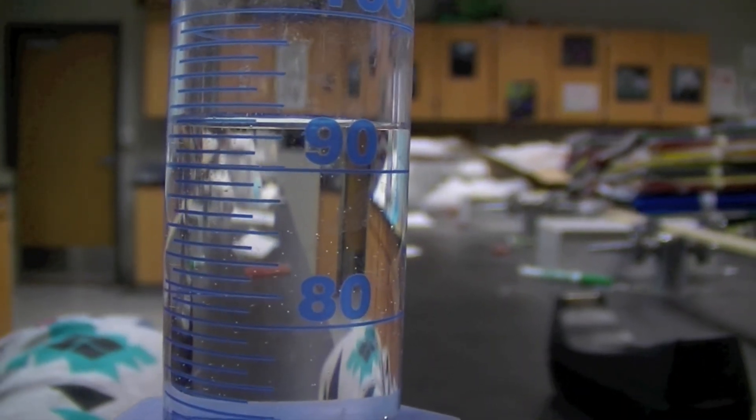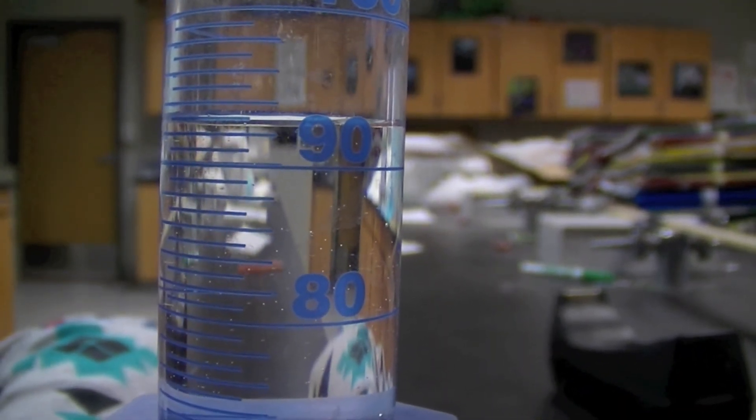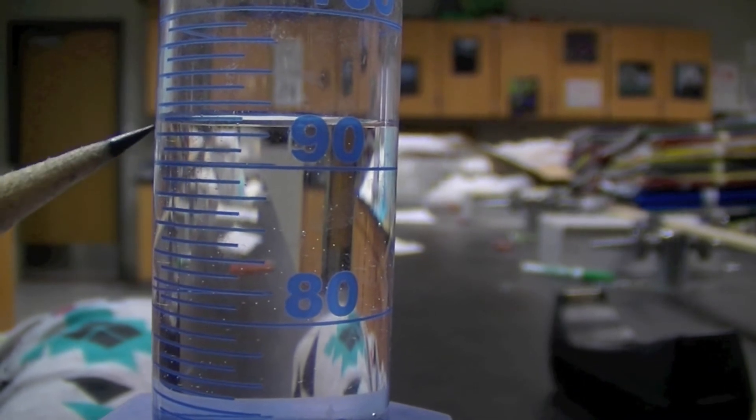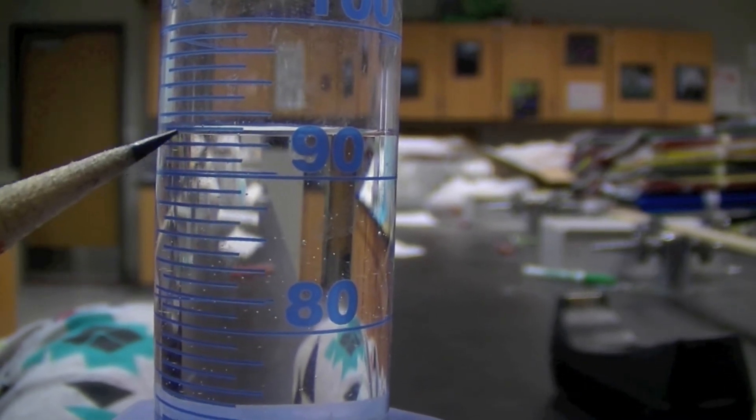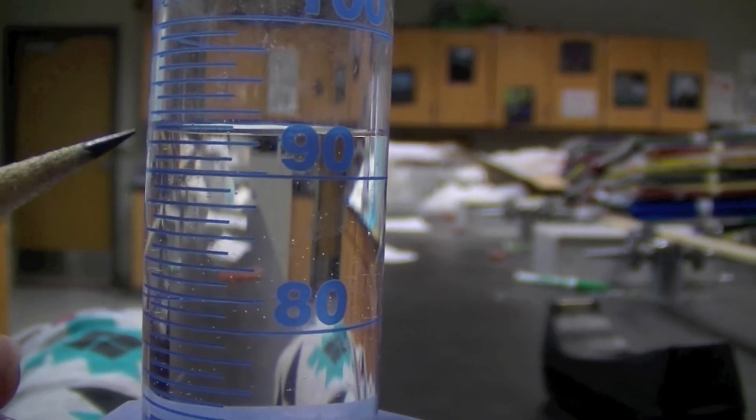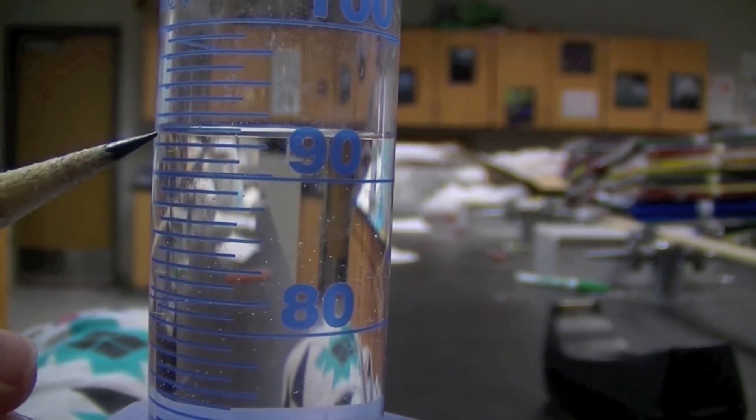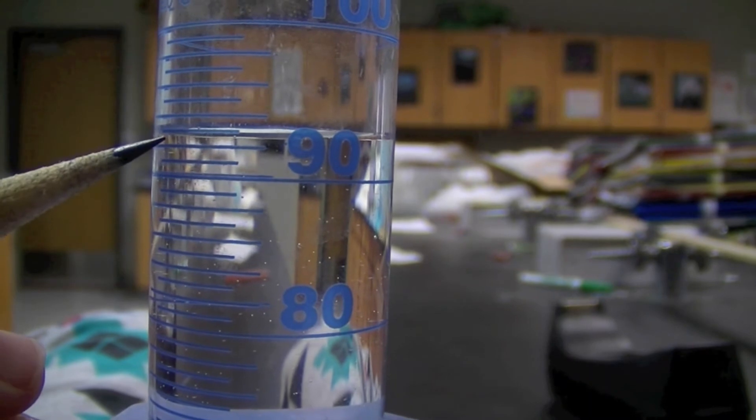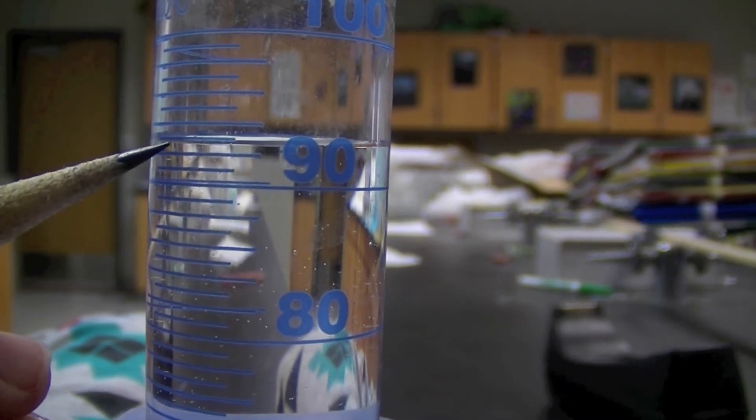So when we measure using a graduated cylinder, we have to look for the bottom of the meniscus. Water isn't flat, there's a small bubble to it, it bubbles down. So we have to find that bubble where it bubbles down on the bottom of the meniscus. Here, it's just below 93 milliliters.